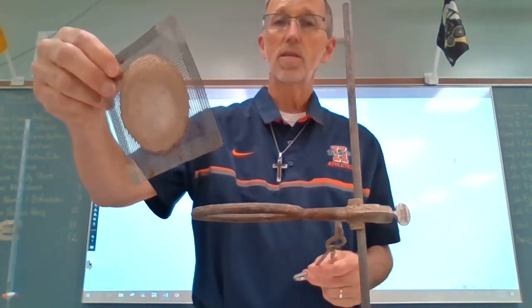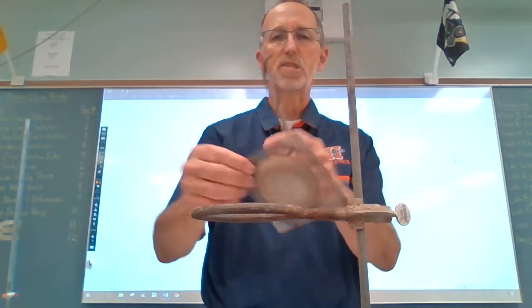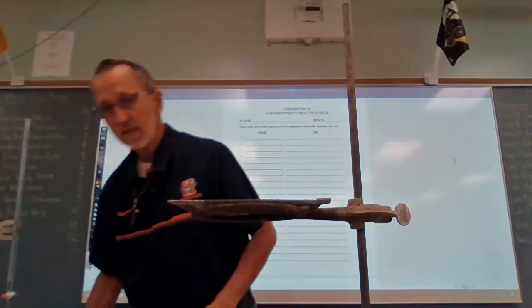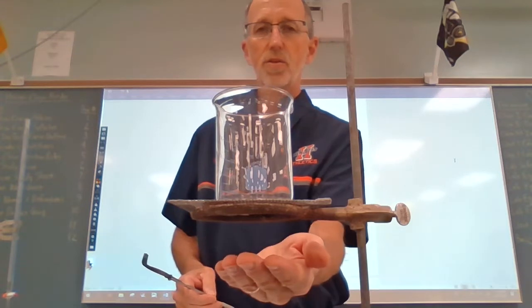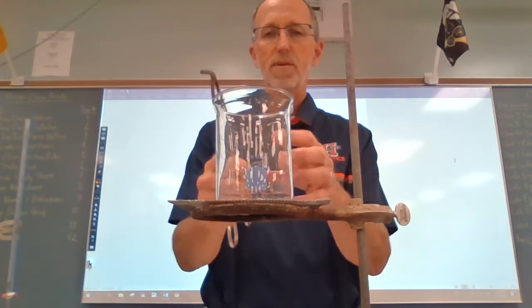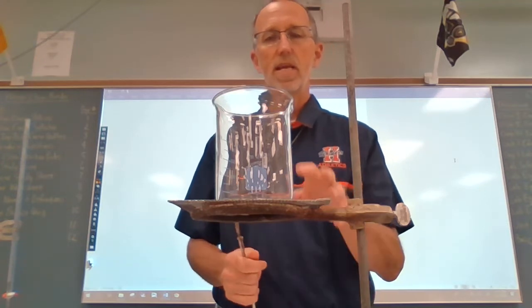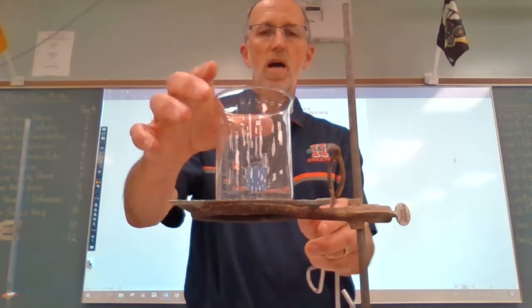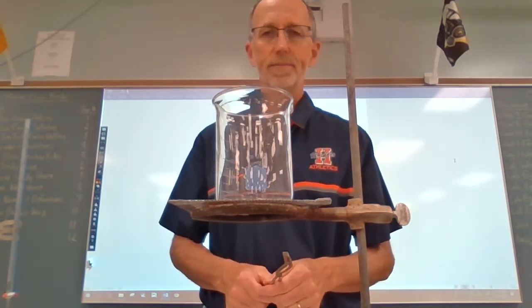You see it's got this circular pad on it. That's a fire retardant or heat resistant pad that allows the heat to be spread out. So I also use it to heat something up in a beaker. Now the flame is not going directly on the glass, but it's being distributed outward by that pad. And so you could heat something up longer in a beaker, having it sit on a wire gauze, than you could by putting a flame directly under it. Okay?